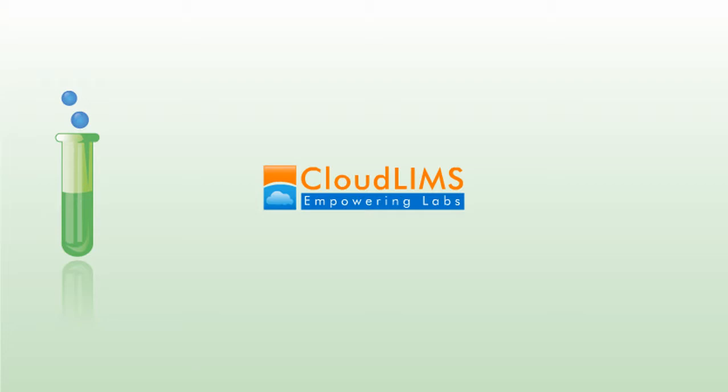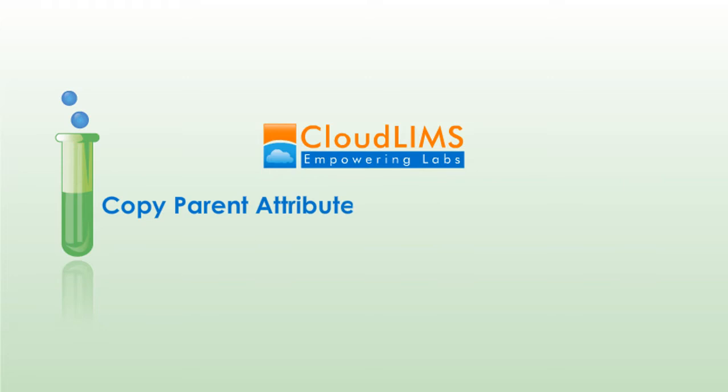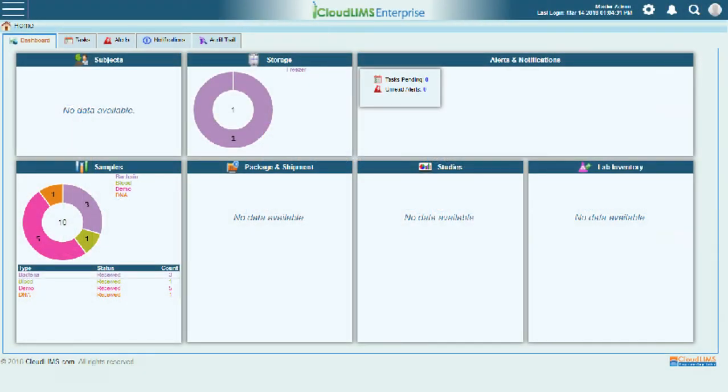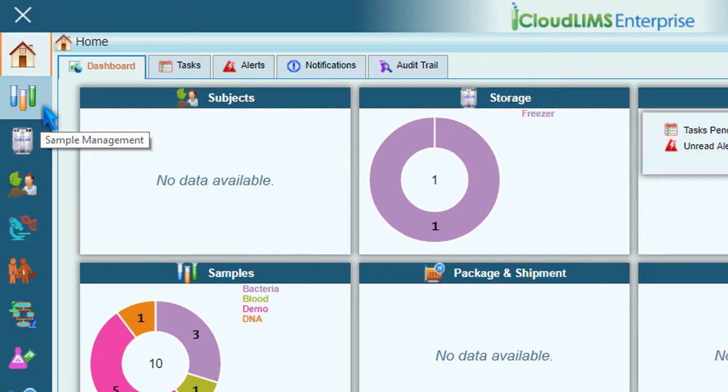Hi, in this video, we'll walk you through the process of copying parent attributes to aliquots or derivatives, avoiding the need to enter the data that is already available in the system. For copying parent attributes, switch to the Sample Management module.